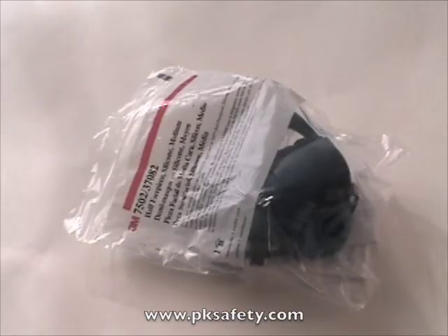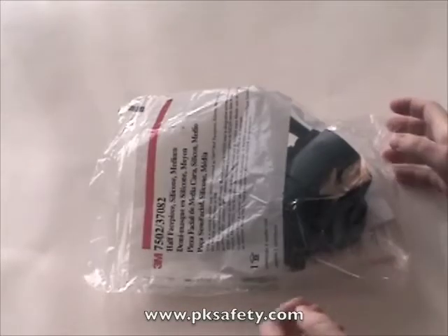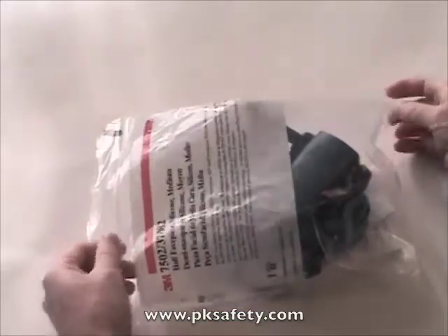Hi, this is Rick Pedley and welcome to PK Safety Supply. Today we're going to be looking at the 3M 7500 series half-mask respirator. This particular one happens to be the 7502 medium size.